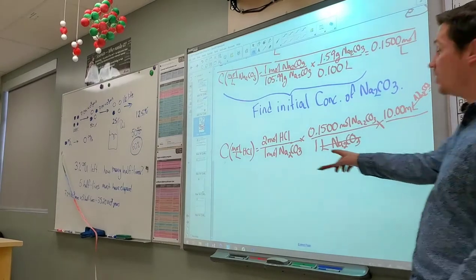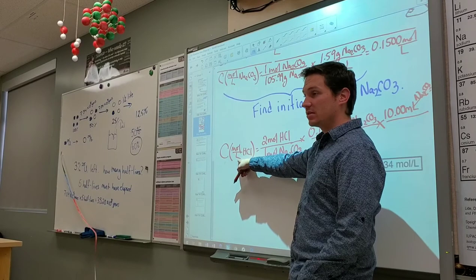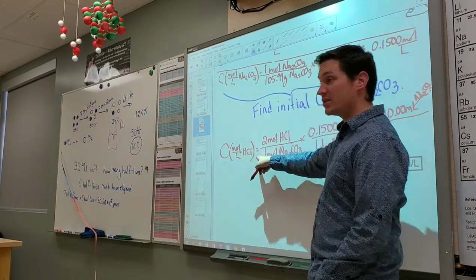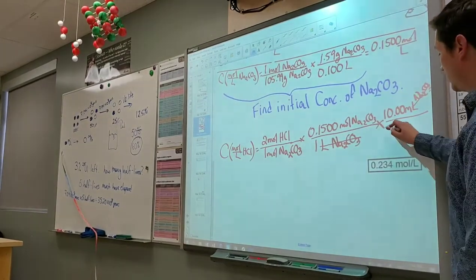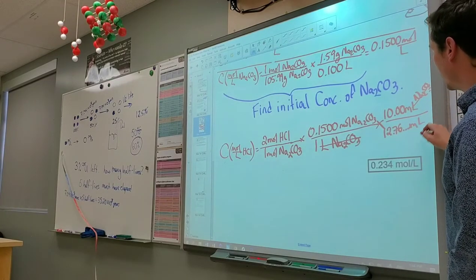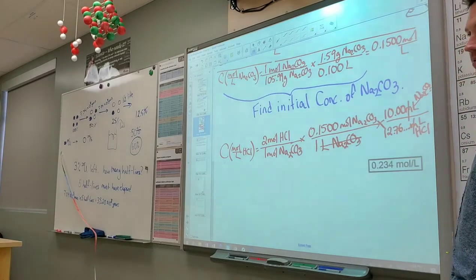What do you want on the bottom? Liters of what substance? Yeah, you have milliliters of HCl, right? How many milliliters of HCl did you add from your burette? 12.76, blah, blah, blah, milliliters of HCl.